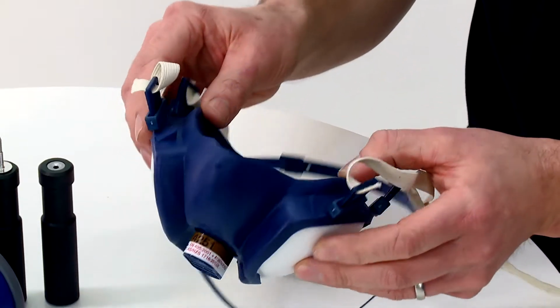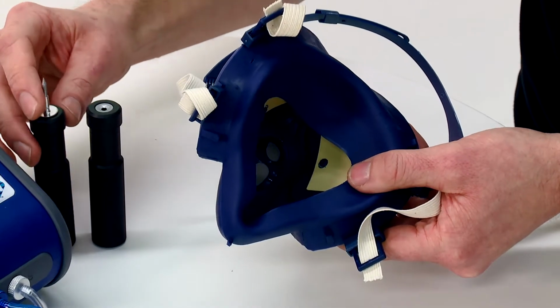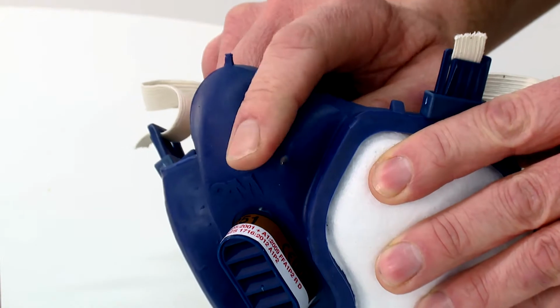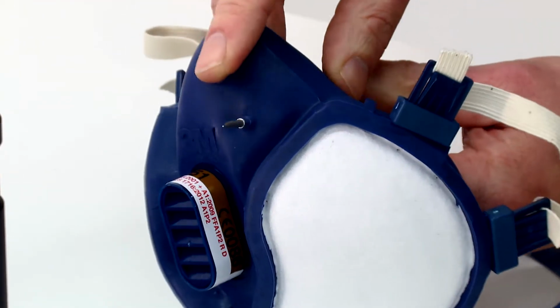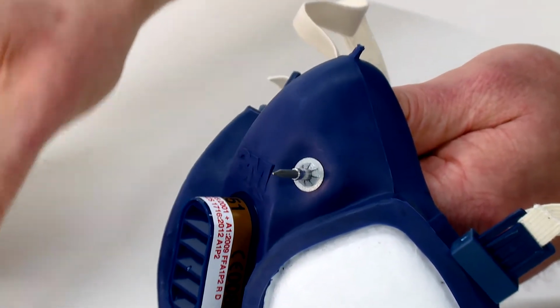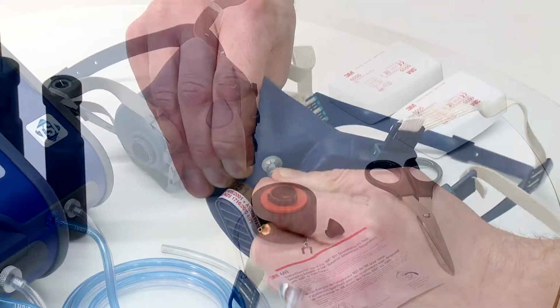A 3M 4000 series respirator is probed in a similar manner to a 3M disposable respirator. A metal probe is inserted through the elastomeric material of the respirator. Take care to avoid the rigid plastic components of the mask and to avoid placing the probe too close to the nose of the wearer. Connect the clear tube to the probe.